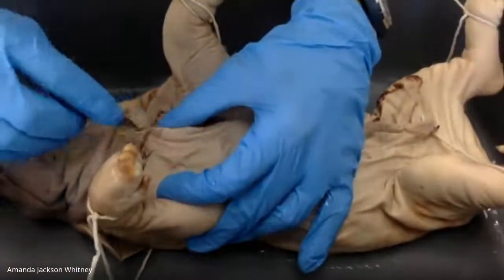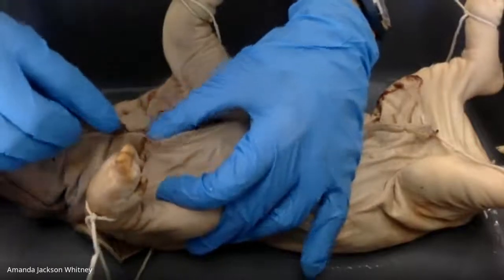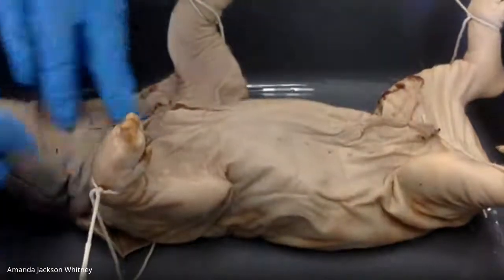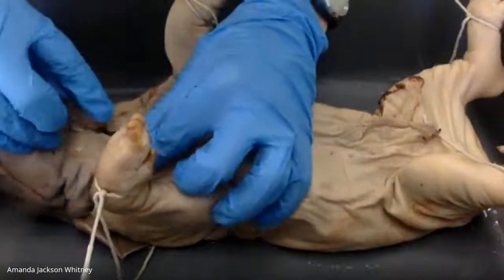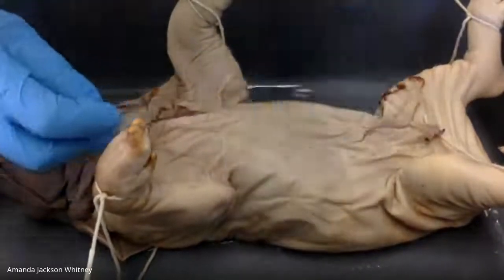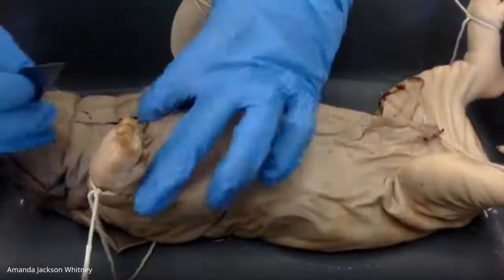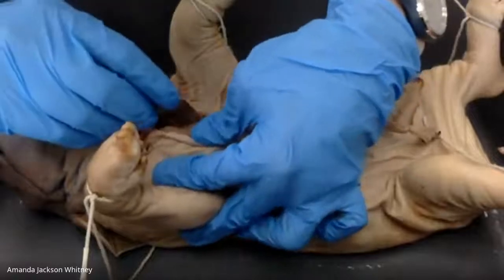Again, if it's possible for you guys to turn on your mics, I would appreciate that, just because I can't really see the chat when my camera's at this angle. If that's not possible, then the chat is better than nothing, but maybe you guys could help me keep an eye on the chat. But yeah, we need to cut through the sternum in order to expose the heart and lungs. So we'll see that in just a little bit here.